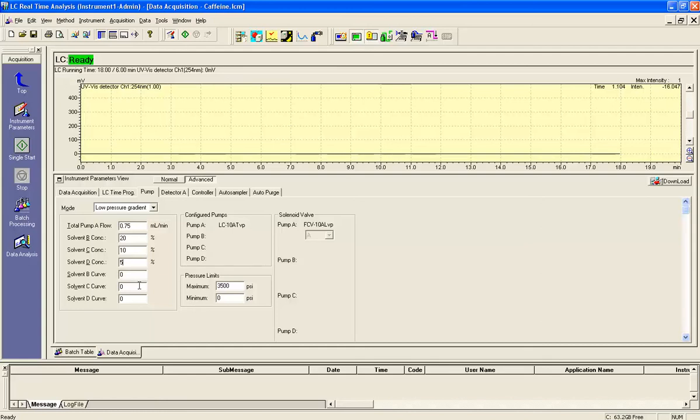That is called the mobile phase composition. One of the most important settings that you can pick on the software itself. So this is very important, right? Whatever's up here, you leave this as default. Now that's isocratic flow. This is me only pulling from one jug and that's it. Low pressure gradient is typically what we use on this instrument, and these are the settings and the way that you make the settings on the software so the machine knows what to do.